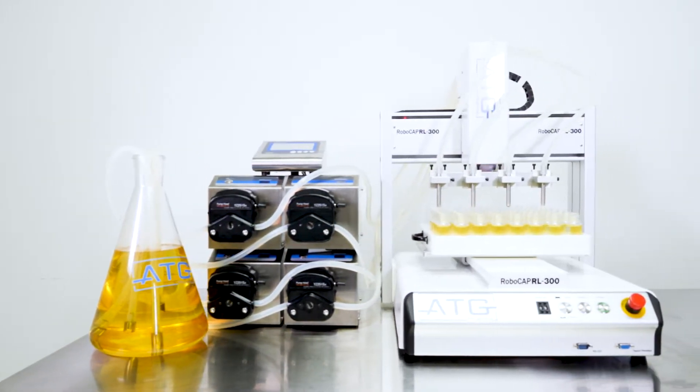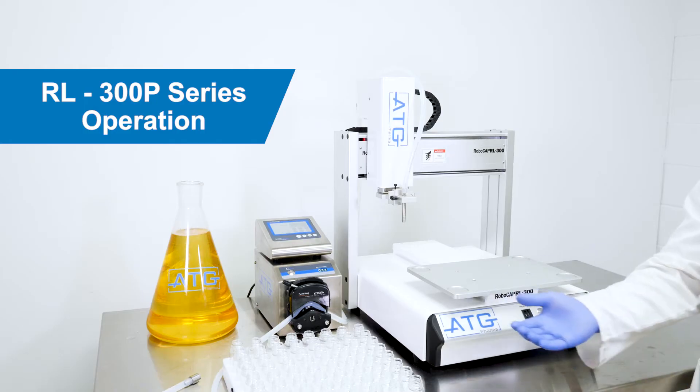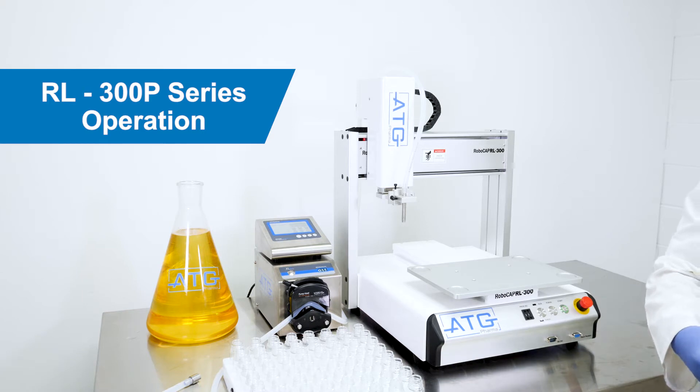ATG Pharma manufactures filling and packaging equipment. Today we're going to do an operational video on the RL300P series.